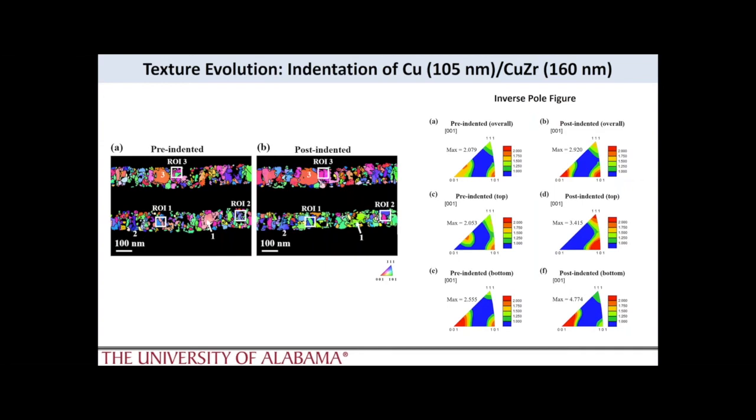And then of course you say, well, if this grain changes rotation, maybe that was because the foil itself bent. But because I'm able to do this analysis for individual grains, I can, for example, look here at grain number 3, and I can see that, for all intents and purposes, it stayed very invariant. I can even notice that other grains, like grain number 2, which is close to the 111 texture, maintained its orientation before and after the indent.